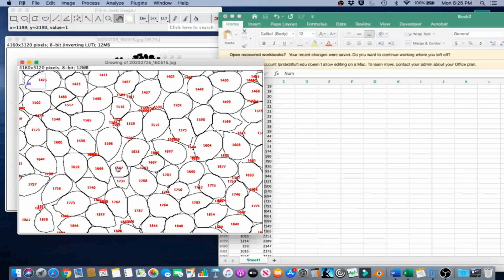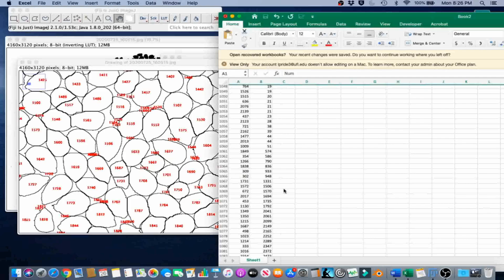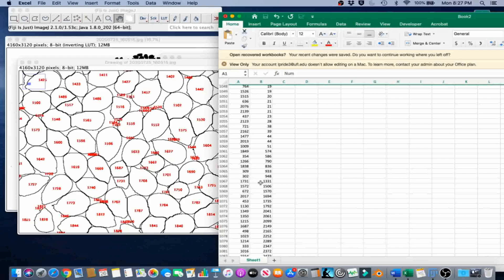There we have it. This is 1331. Sometimes ImageJ splits the seeds. So if we do bigger than this, we'll mostly just be getting seeds. We're going to use that as our lower value, 1331.